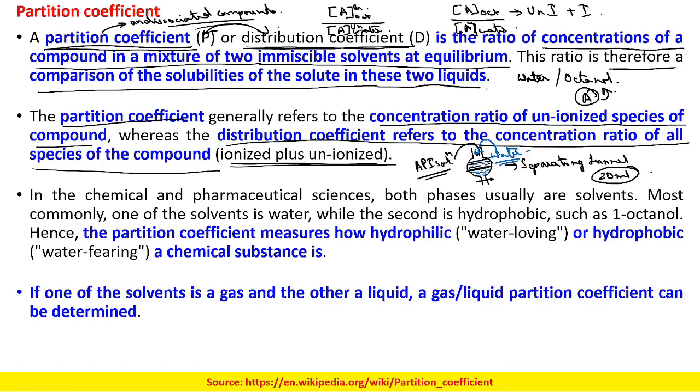Now we will have this tap in the closed position initially. Then we will put the cap, blocking this inlet port, and then we will shake it for say 15 to 20 minutes or 30 minutes, whatever your protocol is. Why are we shaking it? We are shaking it because while we are shaking, we will form an unstable emulsion.